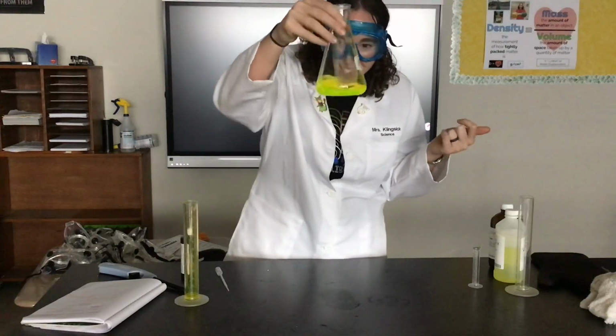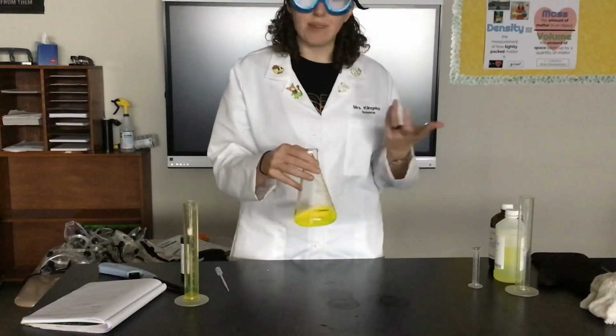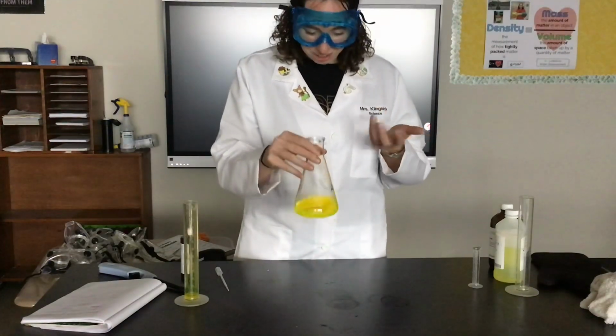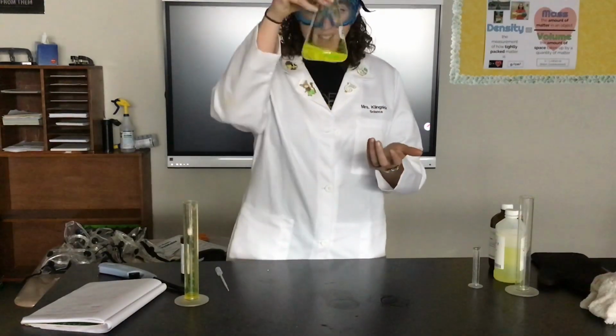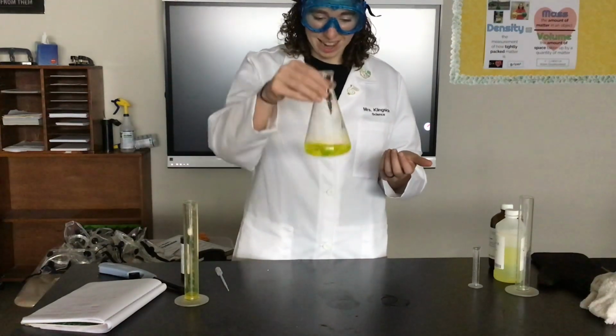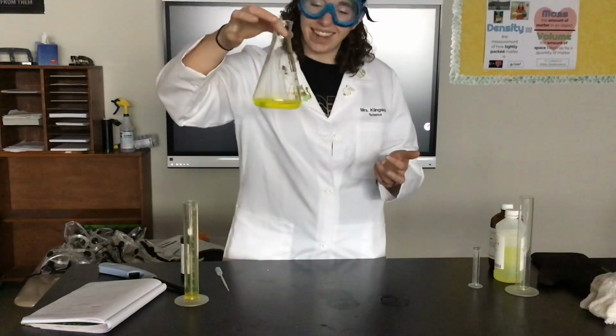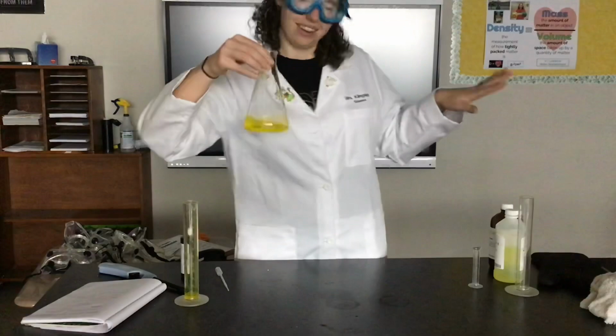You can see, isn't that so cool? So light was created, and that lets me know that a chemical change occurred. Whenever light like in a glow stick happens, that's a chemical change. And we just made a glow stick with a chemical change.